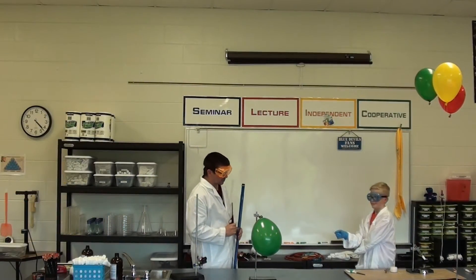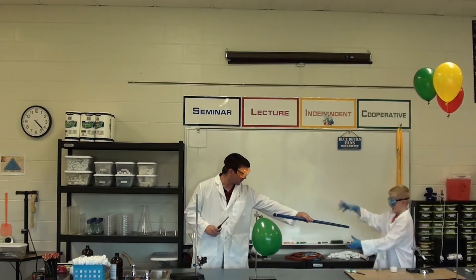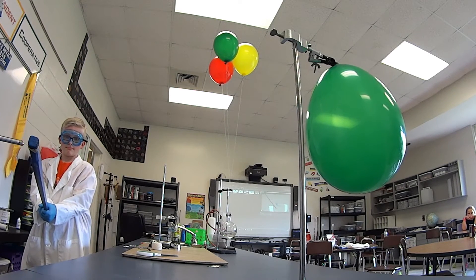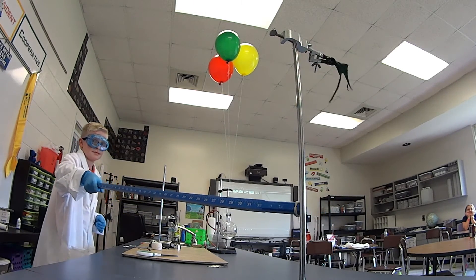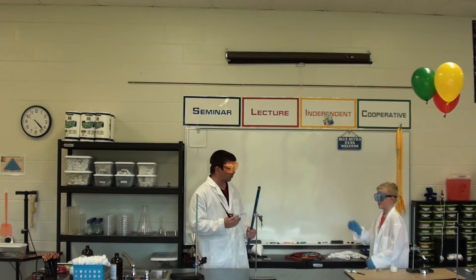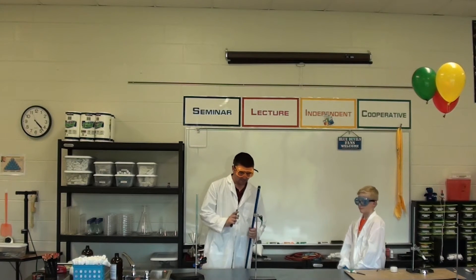We've got our balloons filled with hydrogen, but first let's just look at a regular balloon. We're going to hold a flame underneath the regular balloon — I'm going to give you this stick, hold it up there, and we're just going to light the end of it. Now hold that under our regular balloon. So that's a balloon filled with air. You put a hole in a balloon, which the fire did, and it pops — that's what we expect to happen.